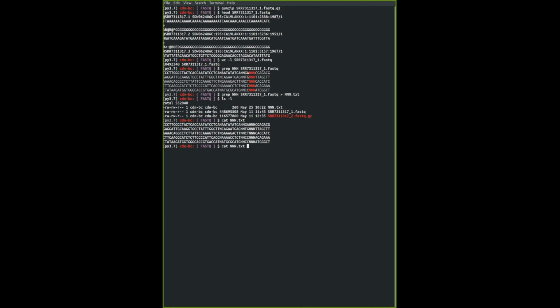So I'm going to go up again, up a couple more, and for the output of this grep, I would like to count the number of lines, and we can use this pipe, which basically redirects the output from the left-hand side of the pipe into the command on the right-hand side. I'm going to use wc -l to count the number of lines, and it tells you that there are 5 lines or 5 hits in the whole RNA-seq sequence.